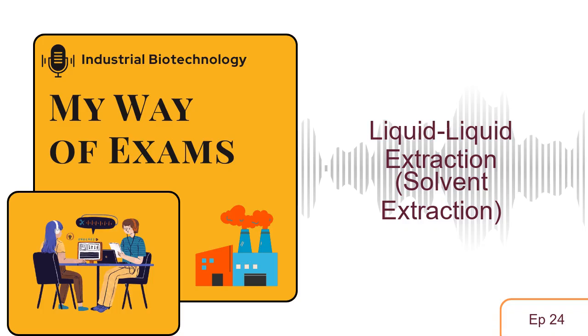Makes sense. And then there's that supercritical fluid extraction I came across. Oh yeah, supercritical fluid extraction, or SFE. It's sometimes a greener way to go. It uses things like carbon dioxide, CO2, under very specific pressure and temperature. And here's the cool part: the CO2 takes on properties of both liquids and gases. You can actually tweak its solvent power just by adjusting the pressure and temperature.